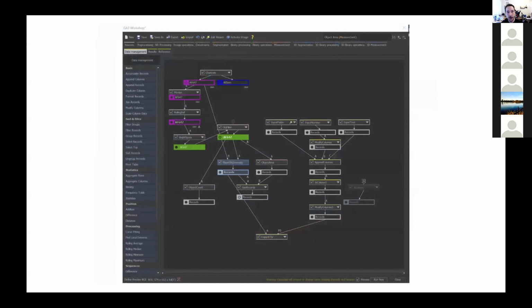And the second step to this is, so Jobs is about automating what's happening at the microscope in concert with analysis. And the way that you can do analysis really powerfully in Elements is using a tool called General Analysis. And more specifically, this General Analysis 3 is a new approach that has been recently launched.